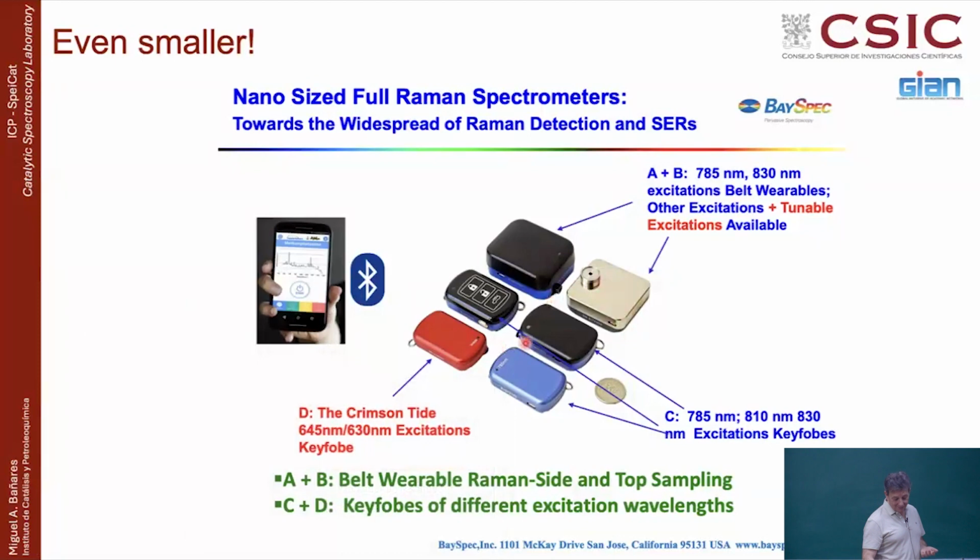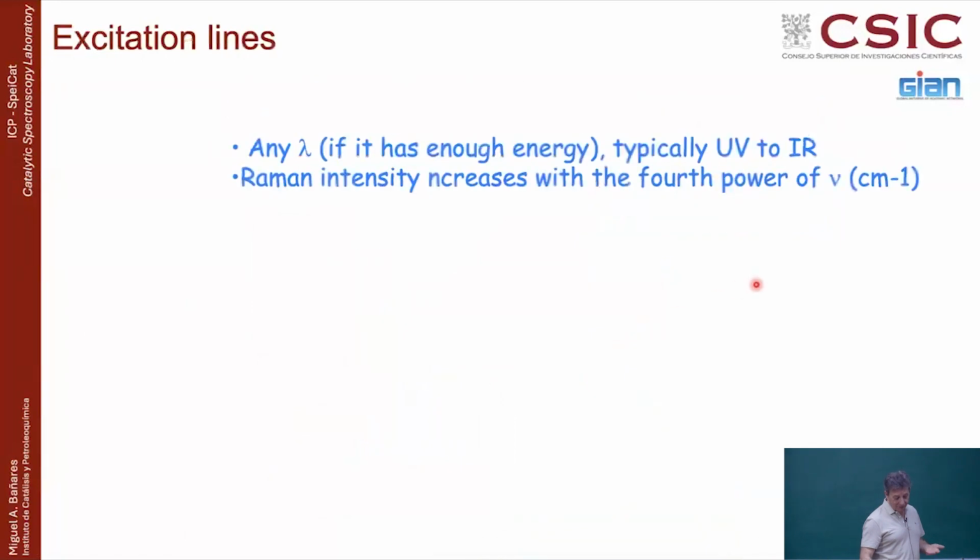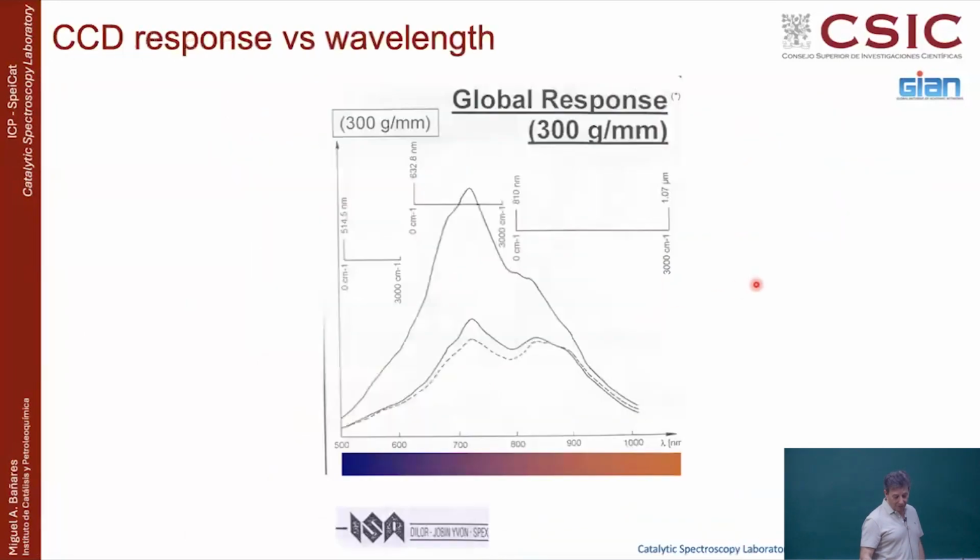And these are like these portable ones. You can put them into water, and Raman is good with any excitation line. I told you that. And that is very interesting because it is another advantage, but at the same time another limitation of the Raman system: it can work at any wavelength. But working at any wavelength, it also has a limitation. You have to read the signal.